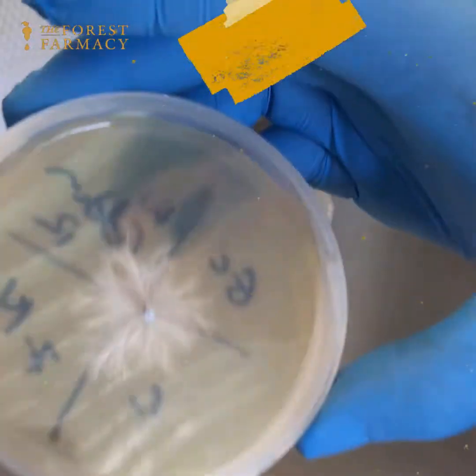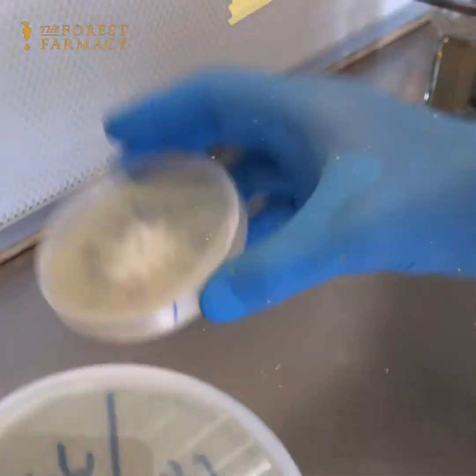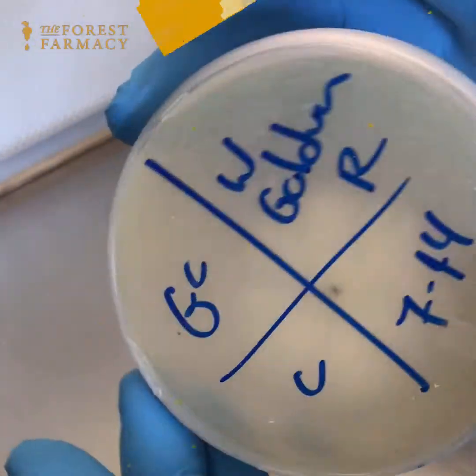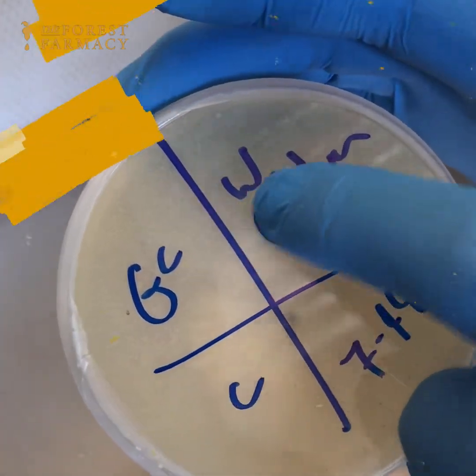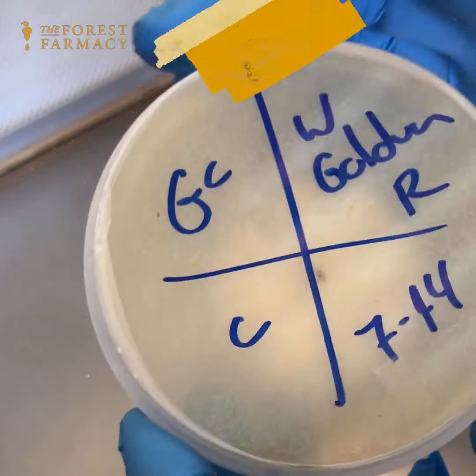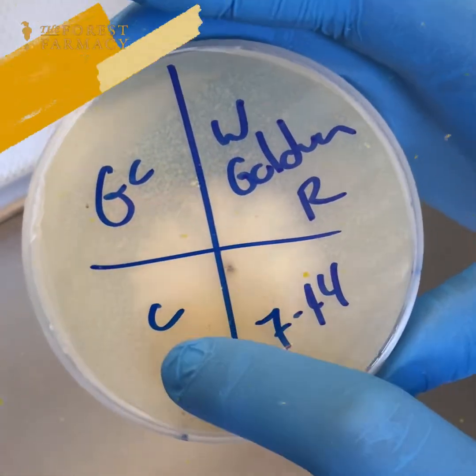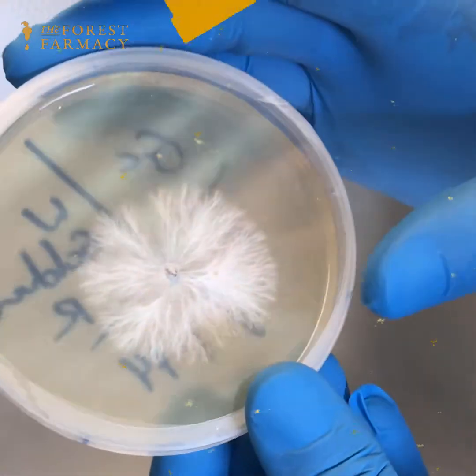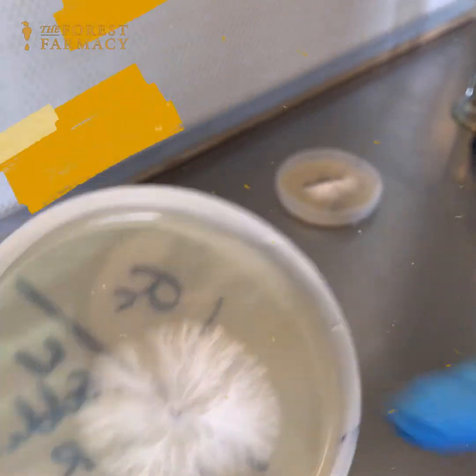You can see the difference in how much this one has run versus how much this one has run. I like the more aggressive ones — that's what I usually select for. This is Ganoderma curtisii, a white golden reishi, but it's not a different subspecies or anything. This tissue culture was done on the 14th and today's the 21st, so one week — and that's pretty great.